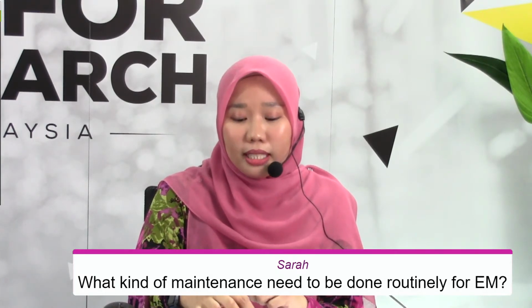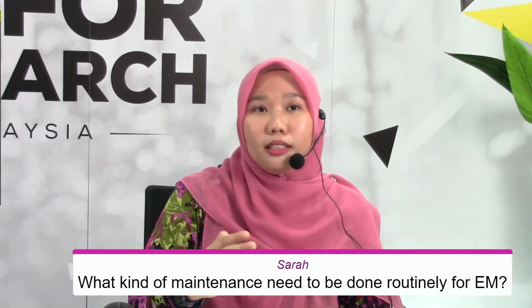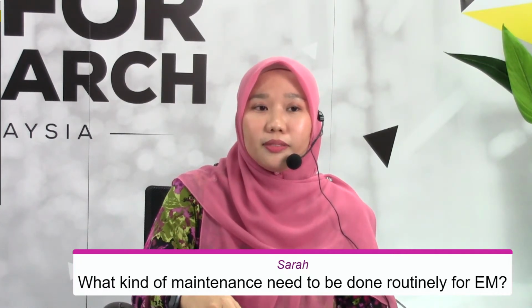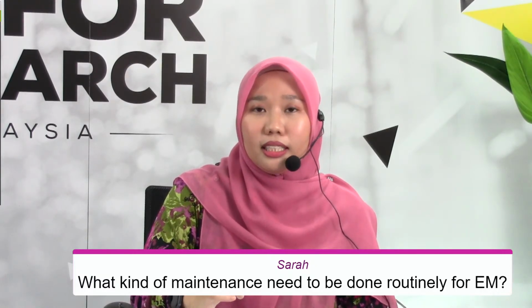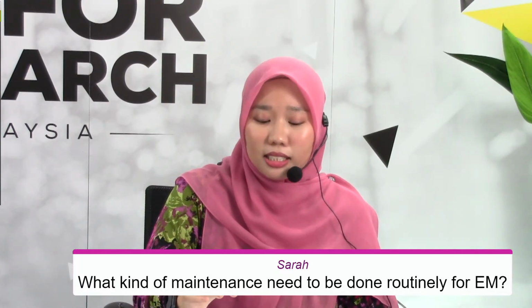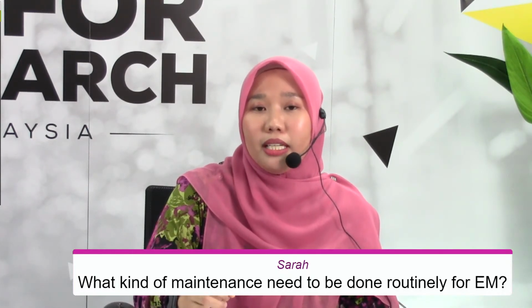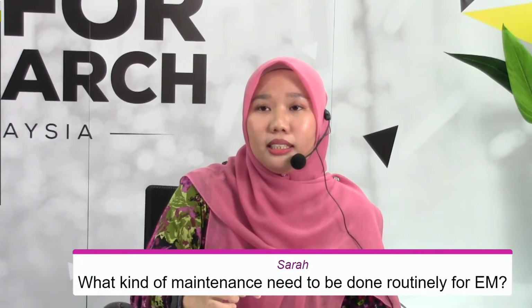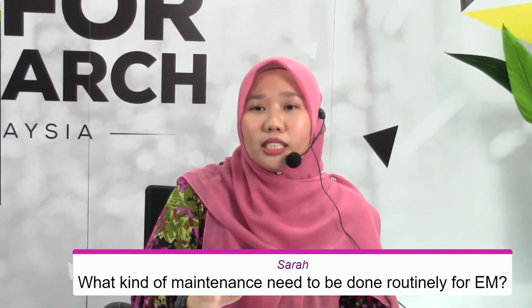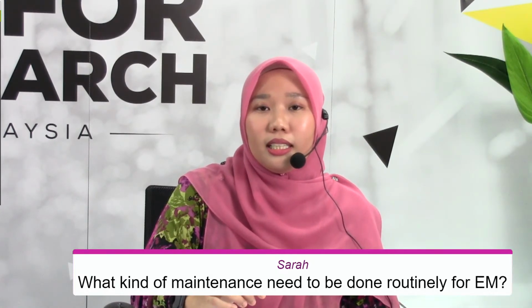But for maintenance up to repairing, usually we have a subsidiary, our own engineers related to the company, who are responsible for gun source replacement, filament exchange and so on. Other parts of the accessories of the EM also need to be counted and observed. The maintenance usually happens twice a year. That is the major PPM.